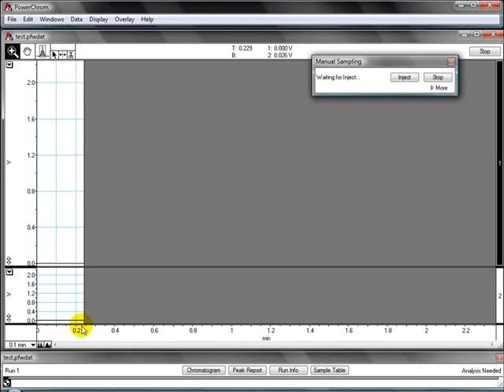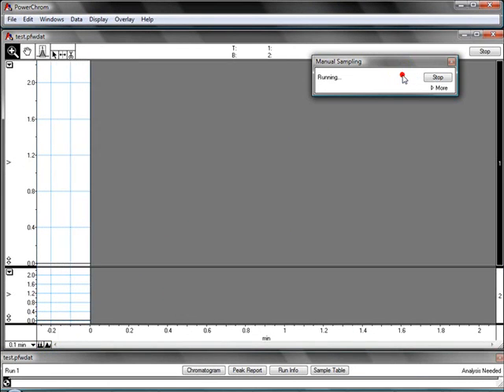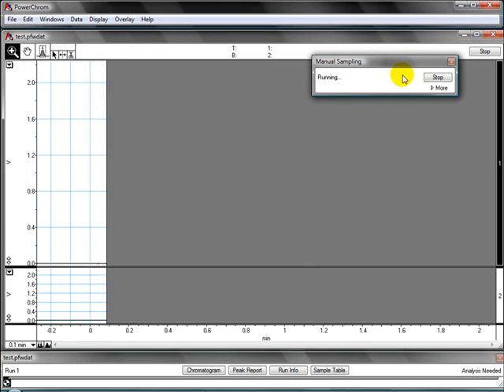When you're ready to inject, you click Inject. And you can then start recording your peaks.